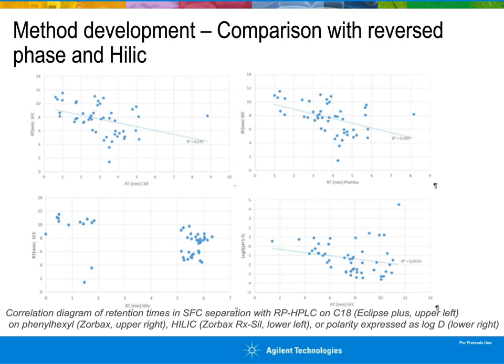The system can be enhanced with multiple valves in order to allow the automatic optimization of more than one modifier. So we actually connected like 10 modifiers. You can have 3 columns connected at the same time, which you can then also automatically change, and the same you could do with the makeup, which we had to do manually because it was an isocratic pump.